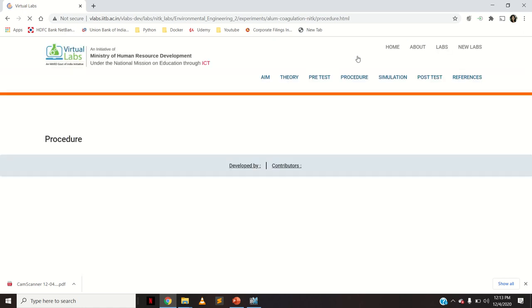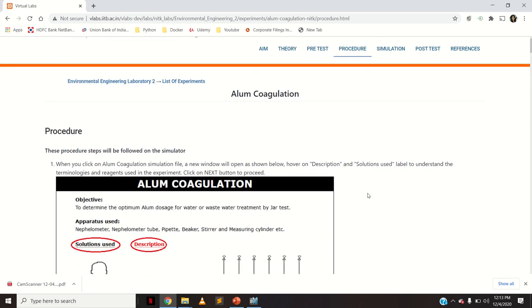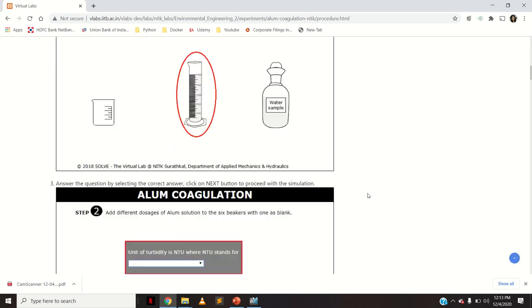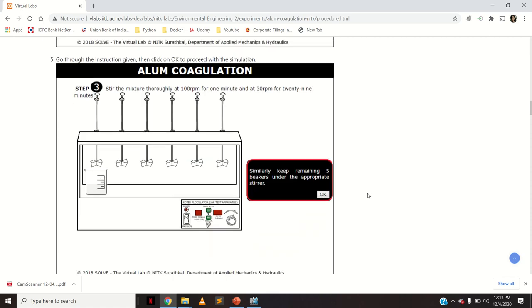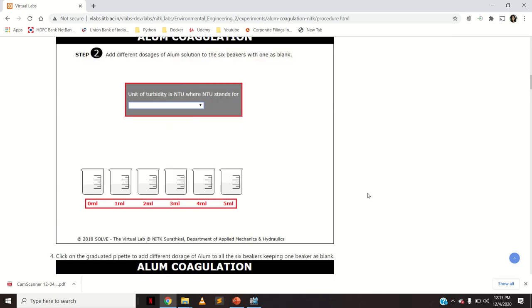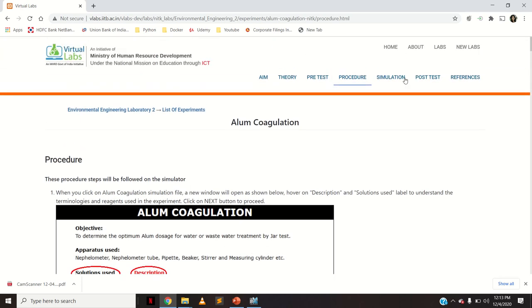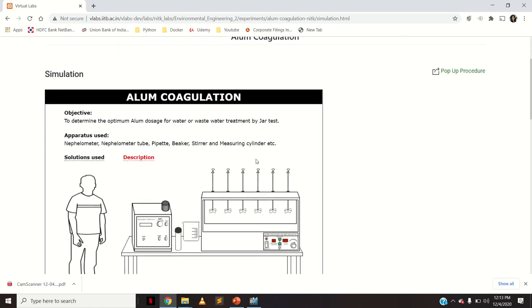The procedure tab contains everything we will be seeing in the simulation part — every step of the simulation is given here. Let us go to the simulation part and start the experiment of alum coagulation, that is determining the optimum dose of alum using the jar test experiment.